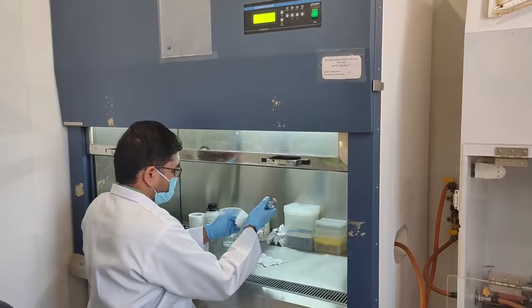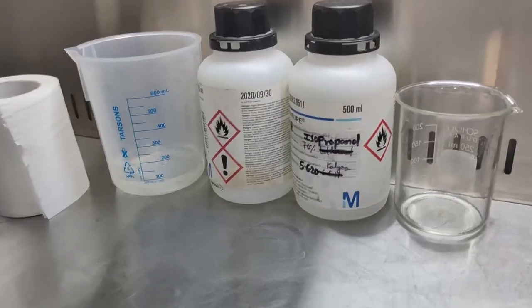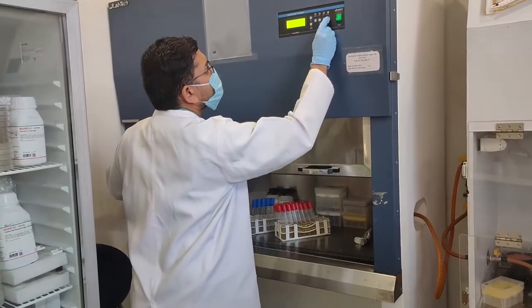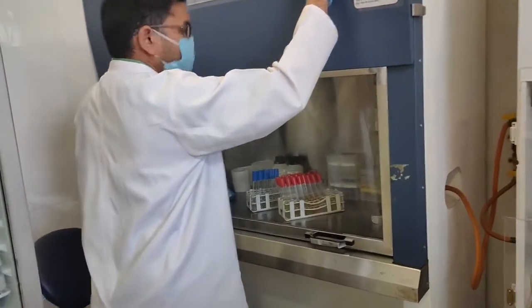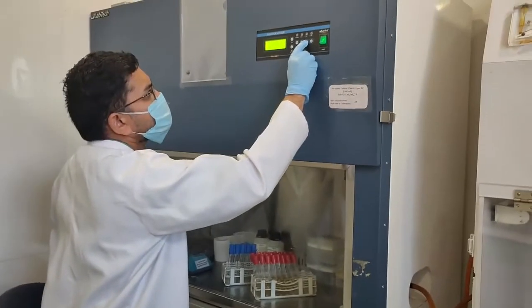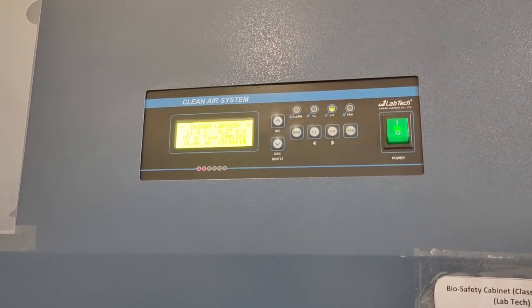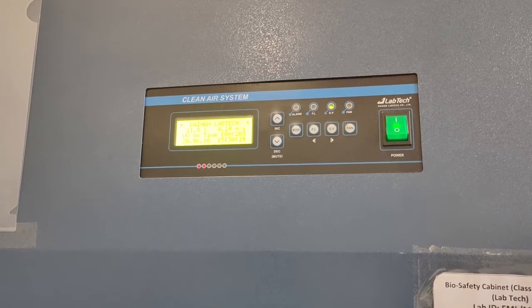Wipe the auto pipettes to be used with 70% isopropanol. Keep the auto pipette tips and tip boxes inside the biosafety cabinet and switch on UV for 20 minutes for surface sterilization. After UV sterilization, take the sample to be tested into the biosafety cabinet.